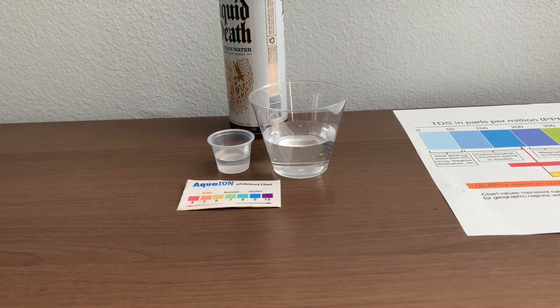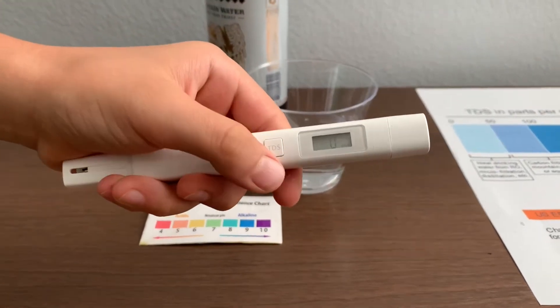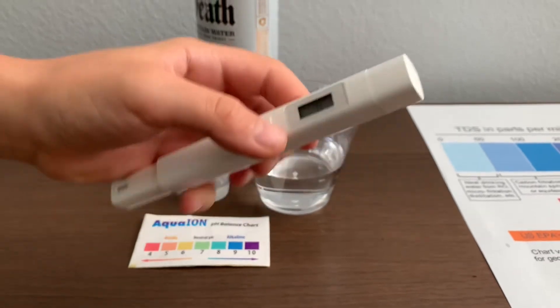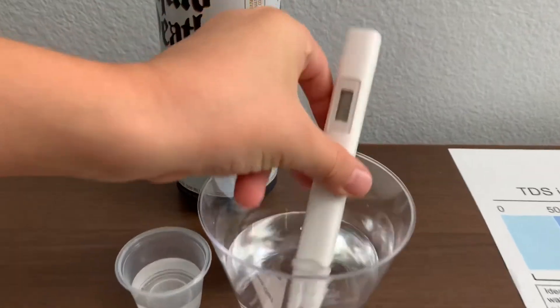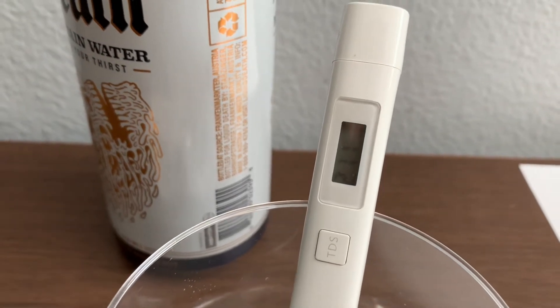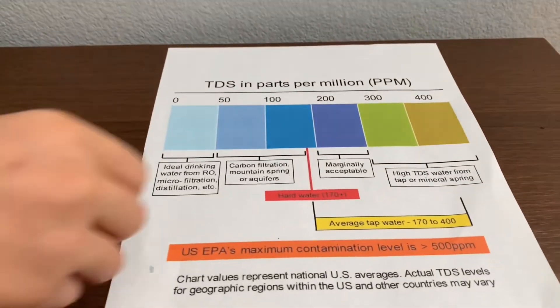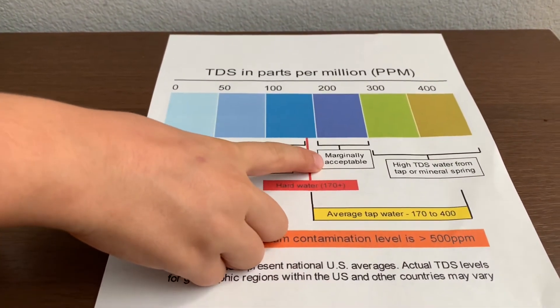First, we're going to test the TDS level. Turn on the TDS tester, make sure it says 0, and put it in. 211. That is marginally acceptable.